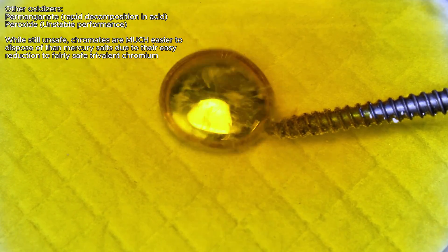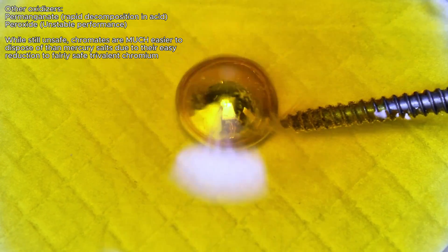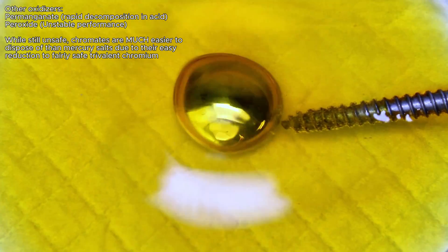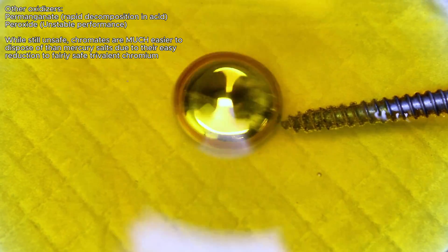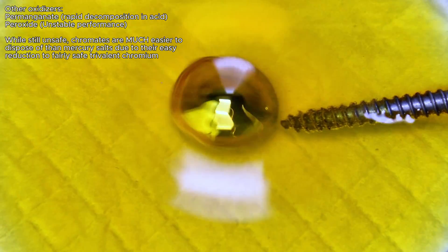30% peroxide was the first alternative I tried, and while it did work, the oscillations weren't nearly as dramatic. Permanganate can also be used, however this compound is not stable in acidic solution and will rapidly decompose into messier byproducts, which more easily obscures the target reaction.